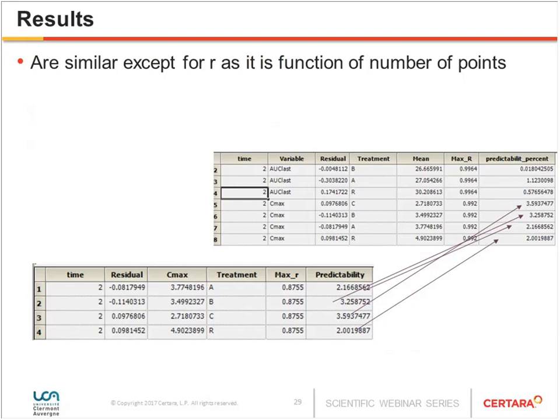If I take the formulation R, it's 2.001988, and I have exactly the same thing. You can see it on the top part of this slide, last line. Why? Because I am going to make the predictability on the mean value, and making the mean value before or after making the regression is not going to provide you any differences.